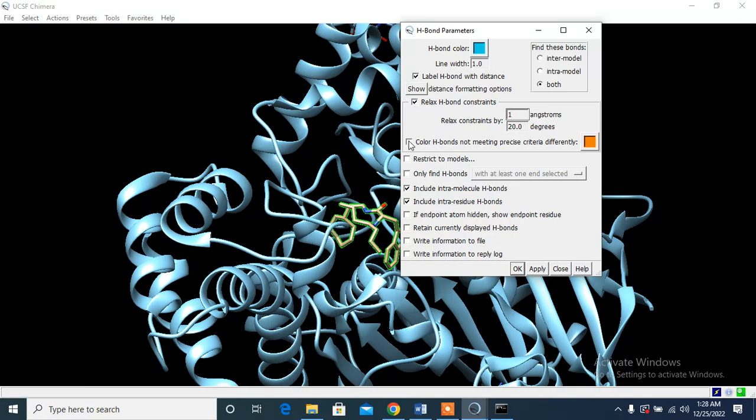So, let me select only hydrogen bond and apply.